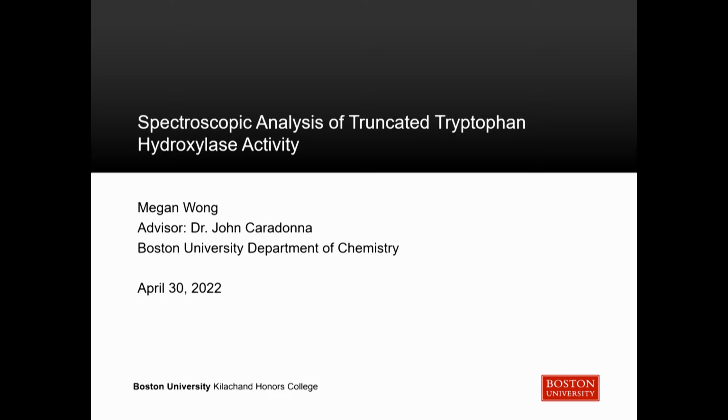Activity. So basically, we're going to be looking at an enzyme called tryptophan hydroxylase, and we're analyzing it using a couple of different techniques that use properties of light in order to figure out how much product we're making with this enzyme.